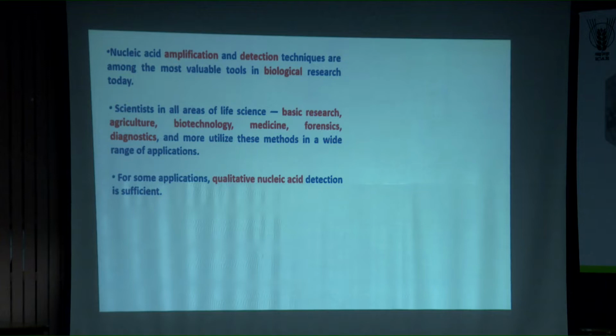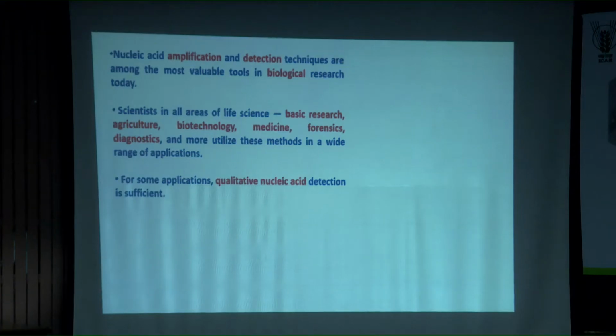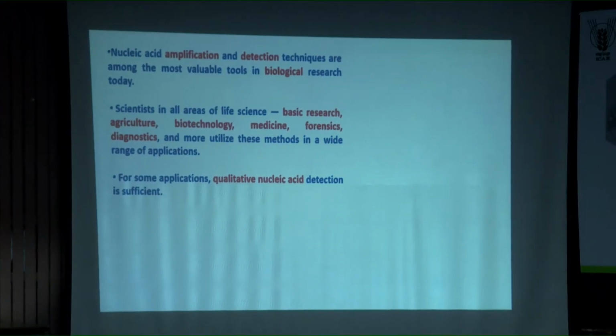So visually, you are not convinced that something happened in the last few hours. So you have to wait another couple of hours to know whether the target in the form of amplicon is really appearing in the matrix, the visualization tool you are using, that is electrophoresis. Whether it is there or not, you will come to know. That means you have to wait 5 to 6 hours to know whether the PCR worked or not, right?